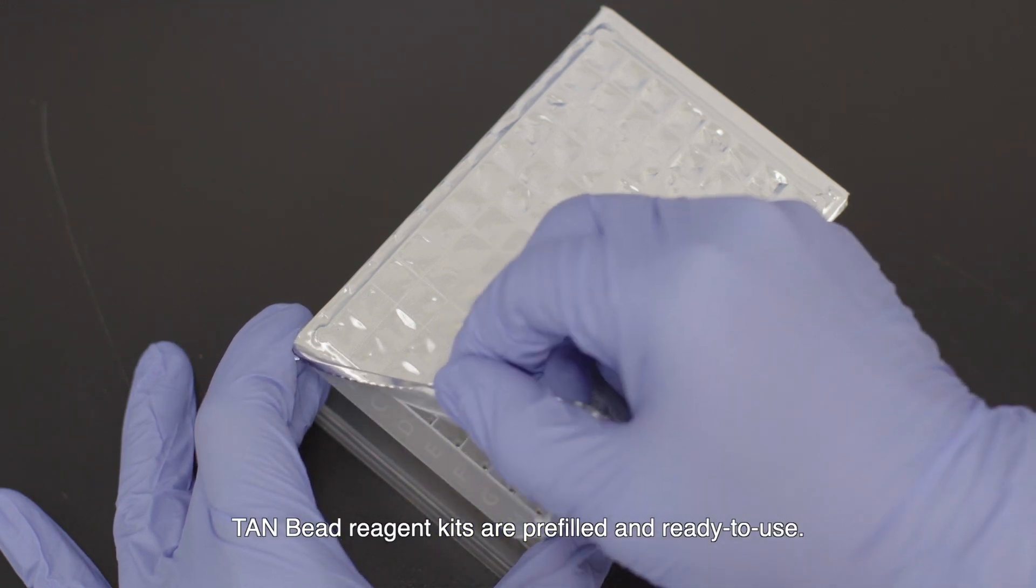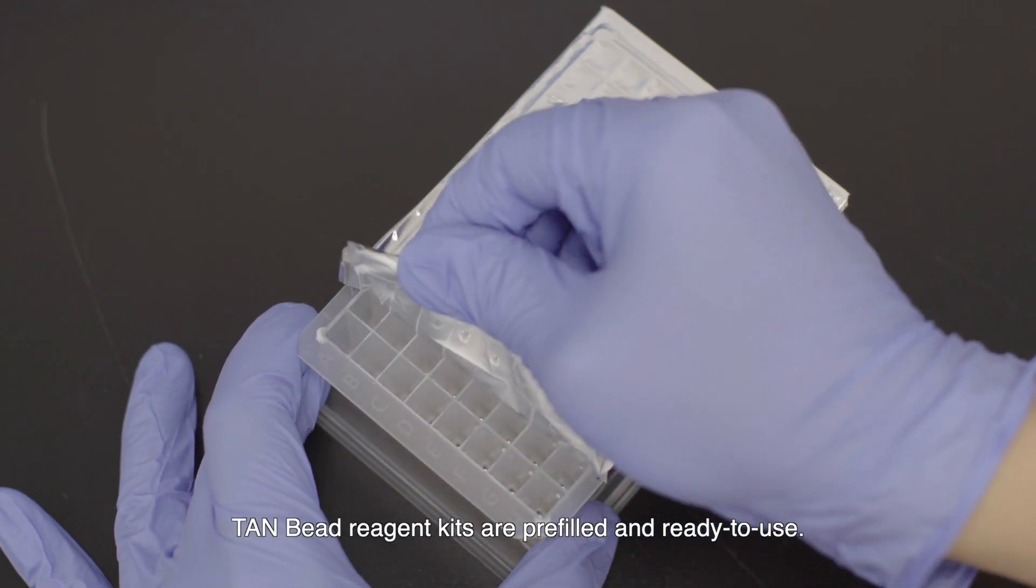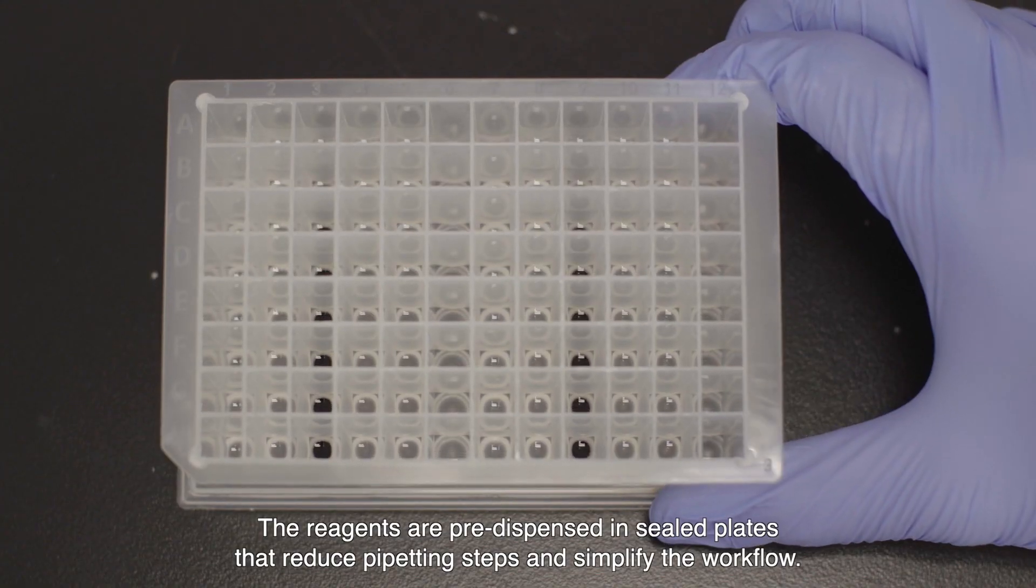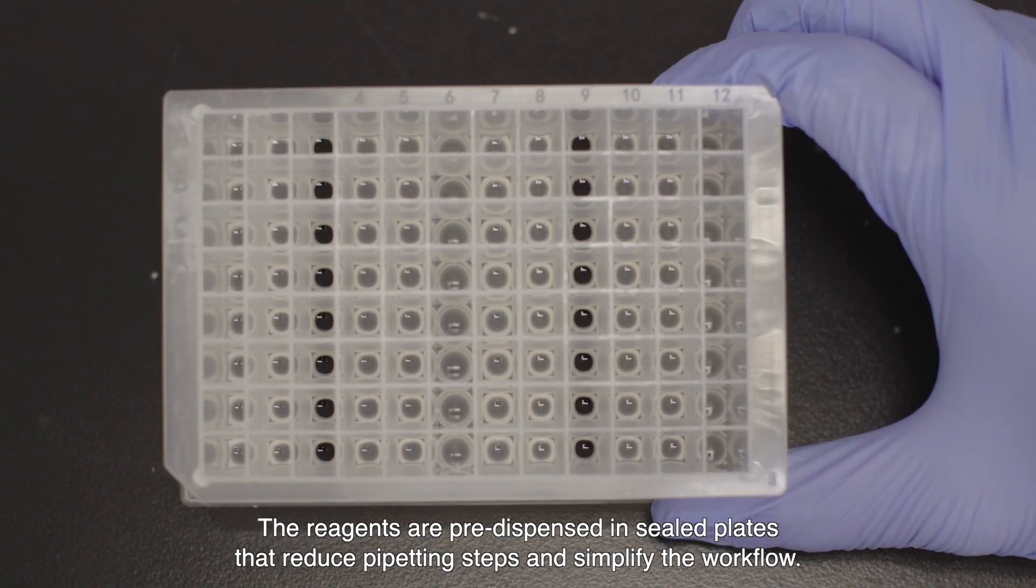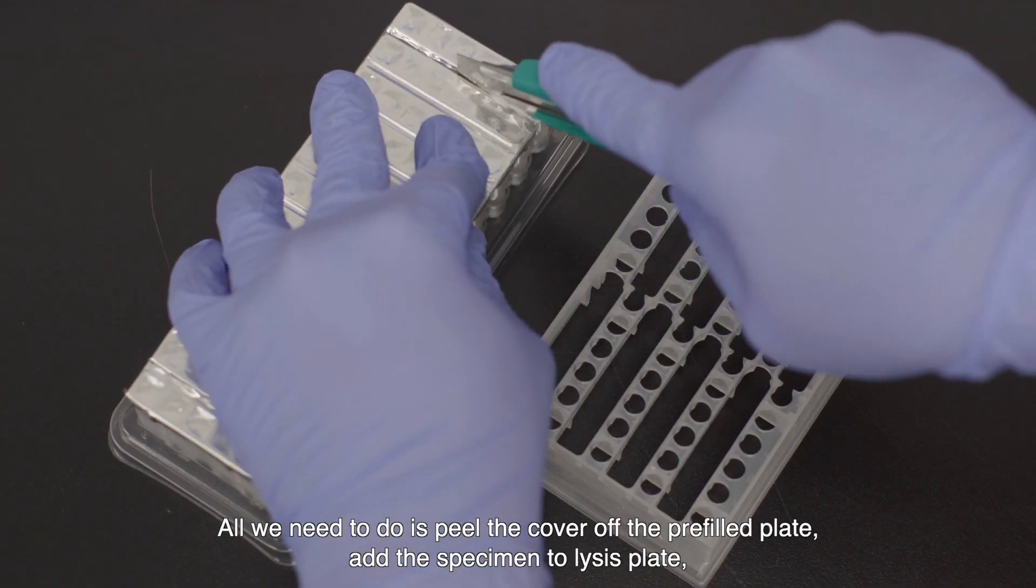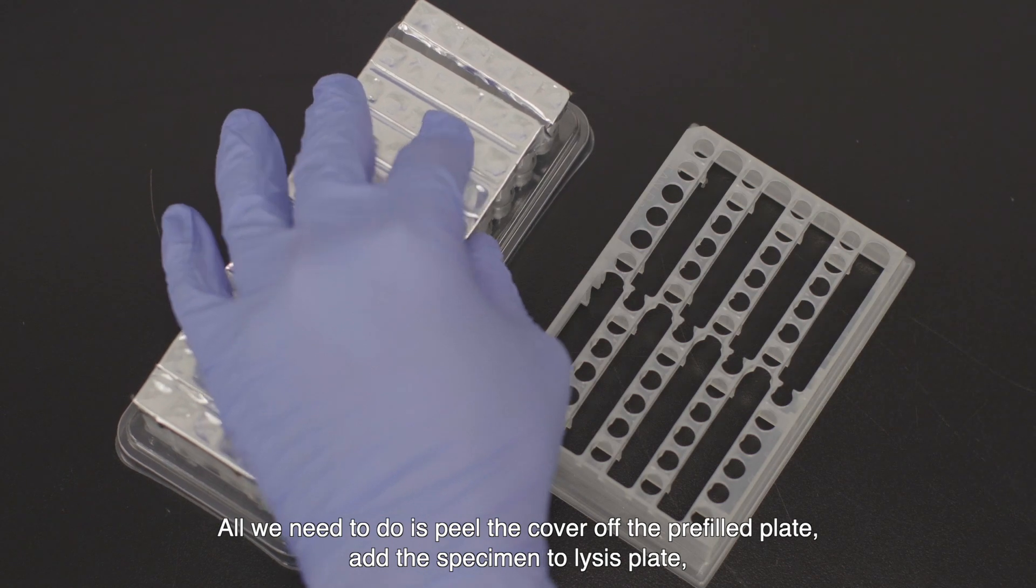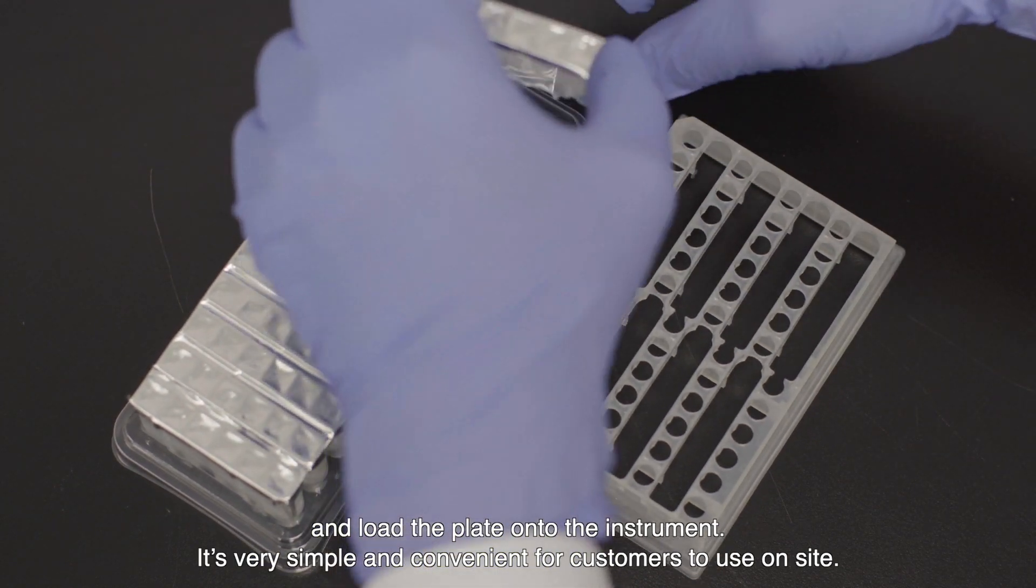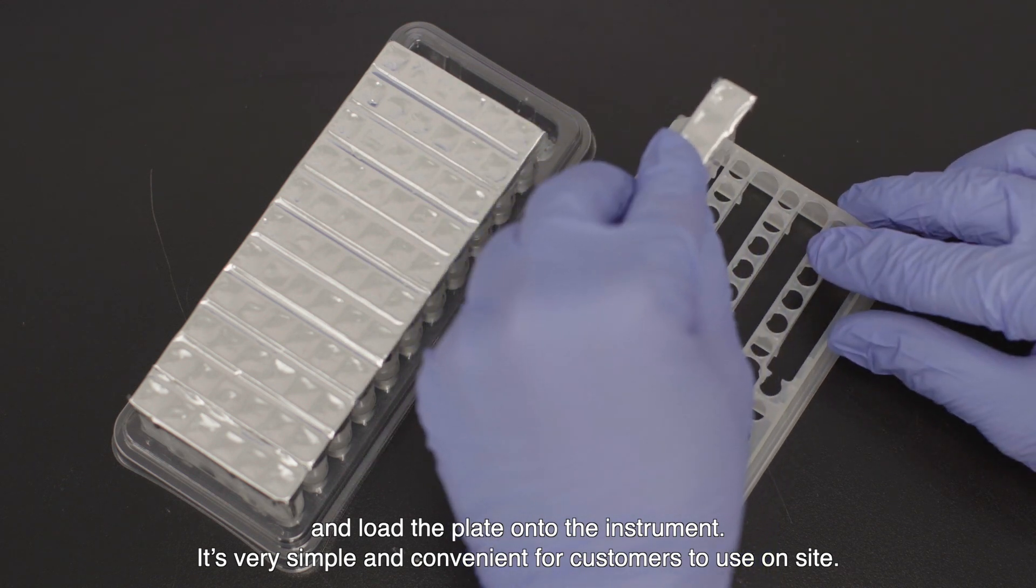TANBead reagent kits are pre-filled and ready to use. The reagents are pre-dispensed in sealed plates that reduce pipetting steps and simplify the workflow. All we need to do is peel the cover off the pre-filled plates, add the specimen to the lysis plate, and load the plate onto the instrument. It's very simple and convenient for customers to use on site.